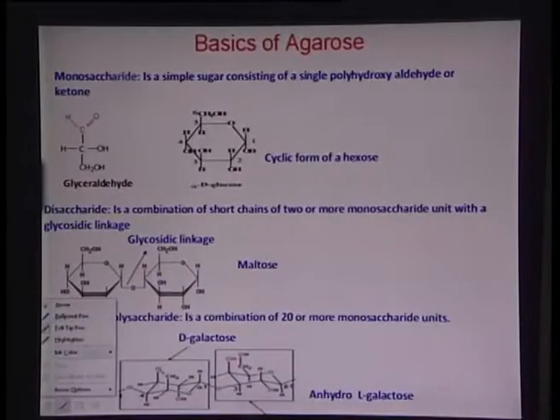So I would, in one of the future lectures, probably try to show you some of the experimental results that even our group has developed in this area of DNA electrophoresis on a surface, called surface electrophoresis. So let us look at some of the basics of these novel gel materials.